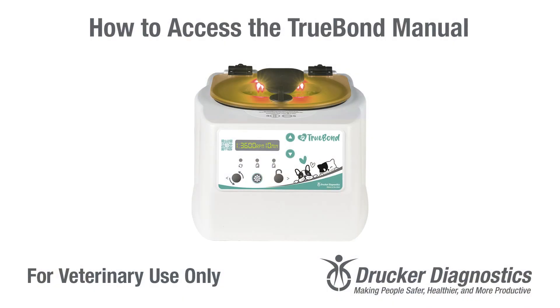How to access the TrueBond manual. Your TrueBond has a QR code on its front panel label. This QR code will take you to a convenient owners portal with a variety of helpful links for your centrifuge, including the manual.